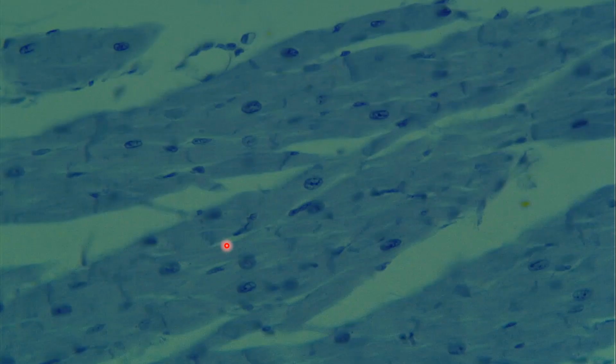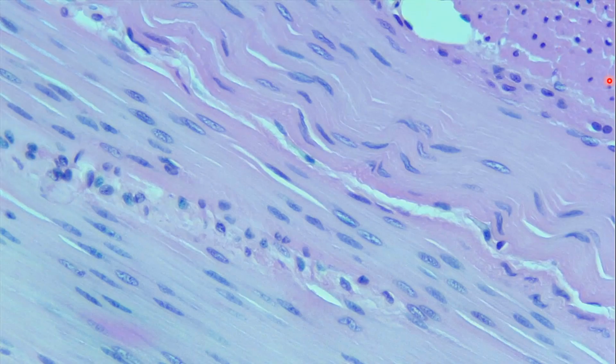Here is an image where you can see cardiac muscle again. So you see these intercalated discs right here, right here, right here. You see the nuclei in the center. It's kind of branching off, so you have these gaps behind them. You can't see the striations as well, but these intercalated discs are going to be the giveaway that you're looking at cardiac muscle. And then the last one we have is actually smooth muscle.